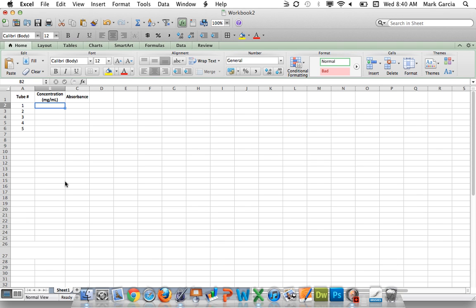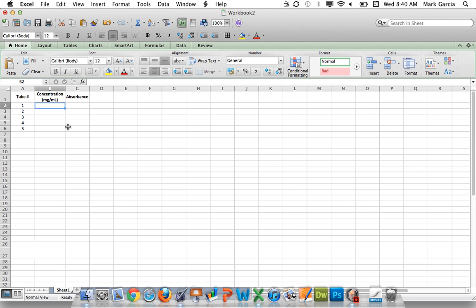One of the commenters asked how you can use the standard curve to calculate the concentration of an unknown sample if you've gotten that sample's absorbance. So what I want to teach you today is how to generate the standard curve and then use that standard curve to get your concentration for your unknown.